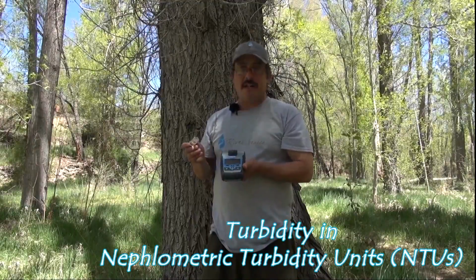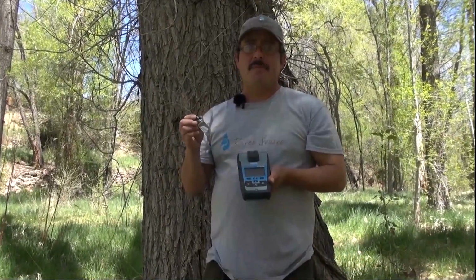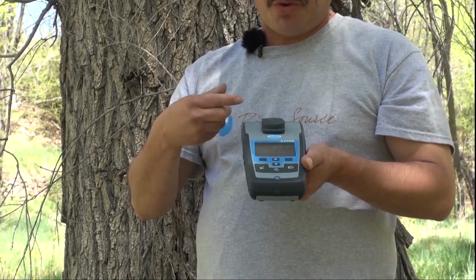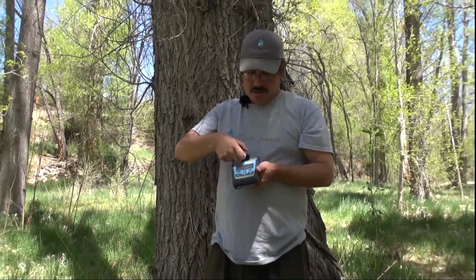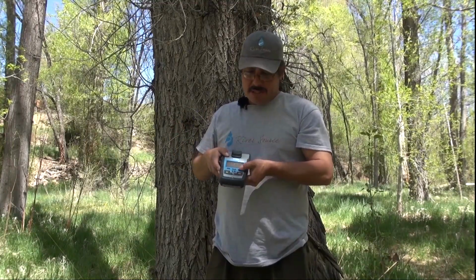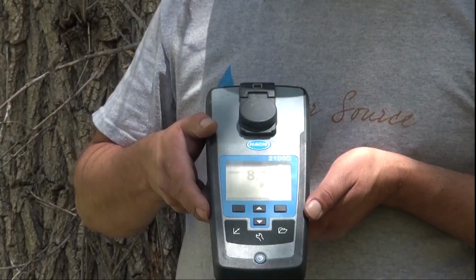The next test that we're going to run is turbidity. Turbidity is a measure of how much dirt or sediment is within the water. One of the things that my kids did after they collected the sample was to clean the vial to make sure that there wasn't any mud or fingerprints on here, as this meter, the turbidity meter, uses light to shoot through the vial and the sample to determine how much sediment is within that water. And so I'll be running my test. We line up this arrow with that arrow on the meter, and we press the read button. It takes a few moments because it's actually taking multiple readings of the turbidity.